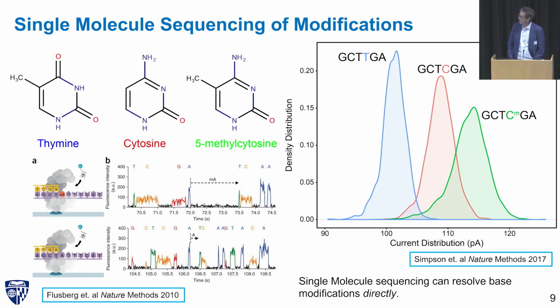I will note that my good friends at PacBio can also detect this based on how much the polymerase pauses when it hits this methylated mark, because methylation does stuff. You know, it's changing the local hydrogen bonding structure. It's changing how the DNA fits in the enzyme. It's changing how the enzyme reacts to it. It's changing how current can flow through the pore around it. So we can actually measure methylation with both of these single molecule platforms. I know I featured more than nanopore stuff, but either platform can actually detect it.